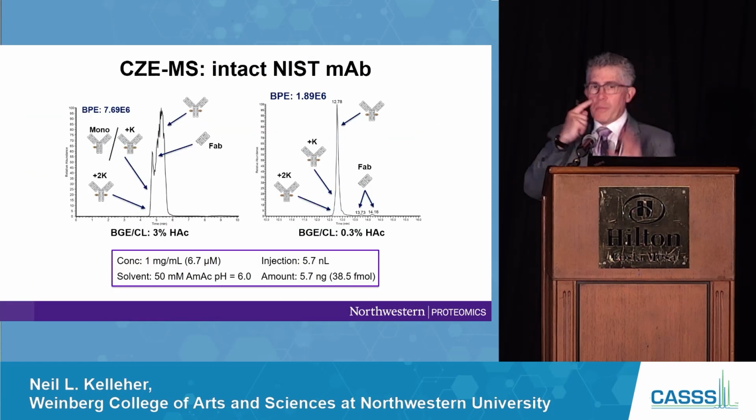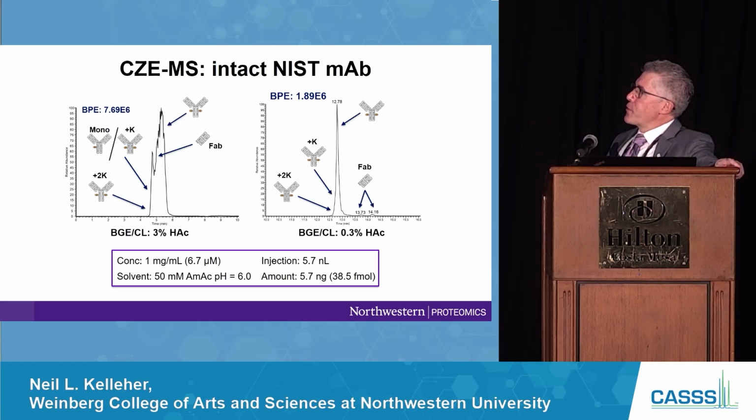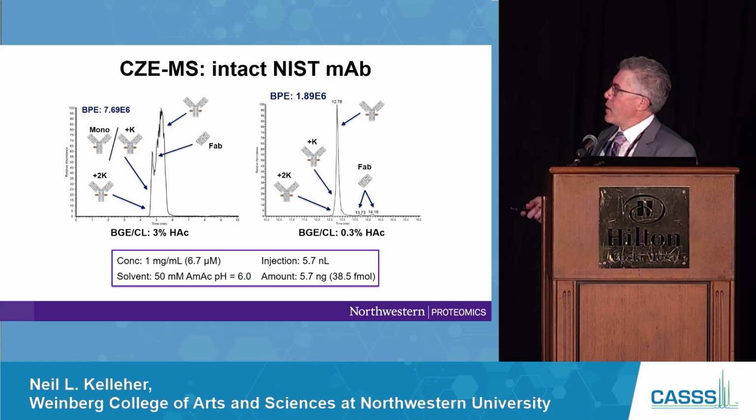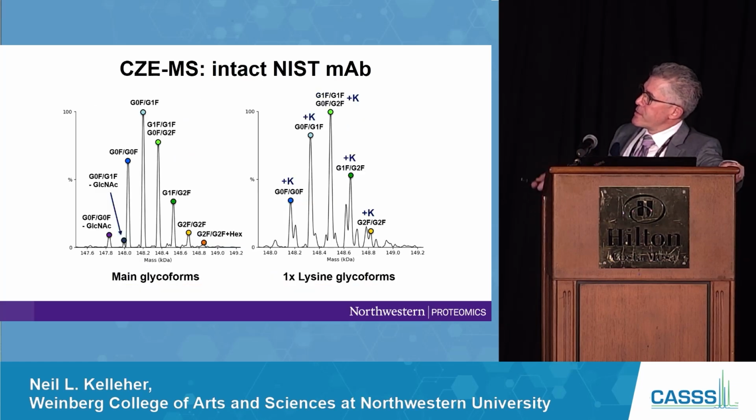Okay, so let's just set the table, starting simply. Here's a postdoc, Kevin Joos, who's now got his own independent lab in the Netherlands. He was doing some basic optimizations of the BGE, shrinking the amount of acid, getting tighter peak widths. These are probably things you've known or even seen this week, but some charge variants here are now detectable, and they can be mapped. So these are intact, just on NIST standard, just beautiful peaks.